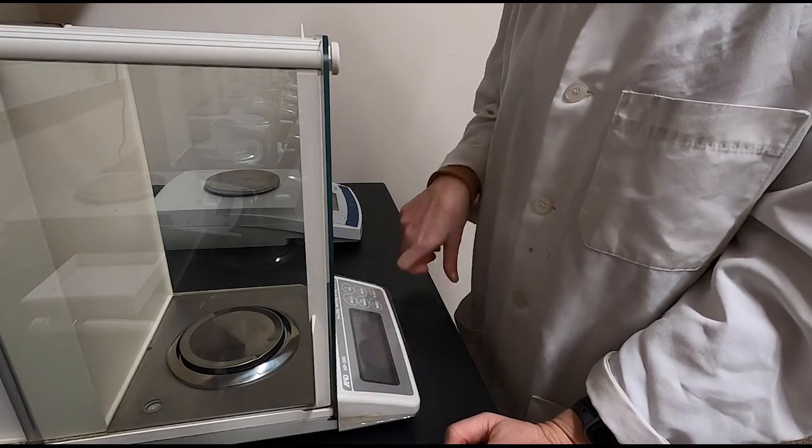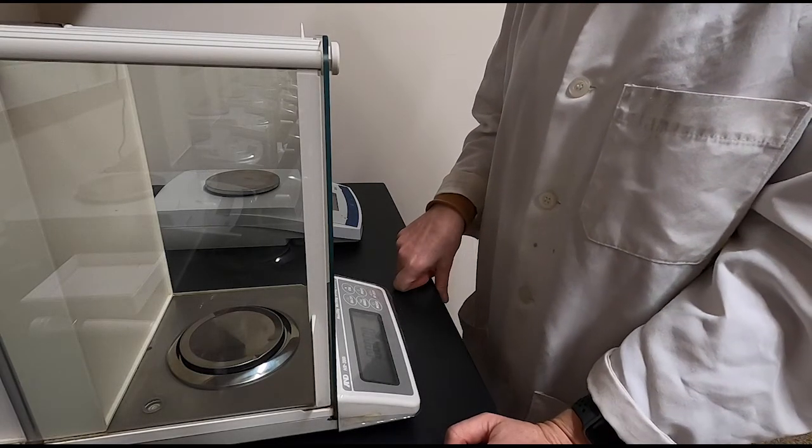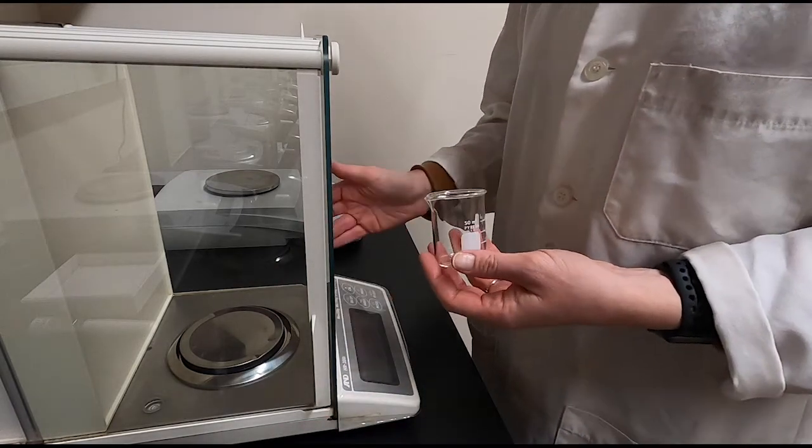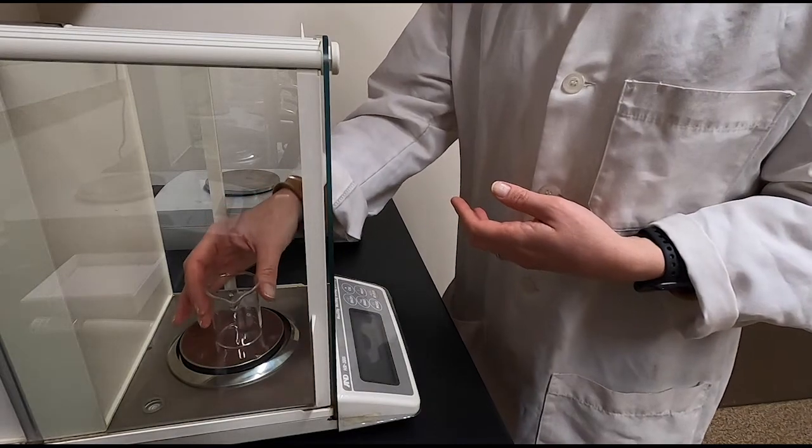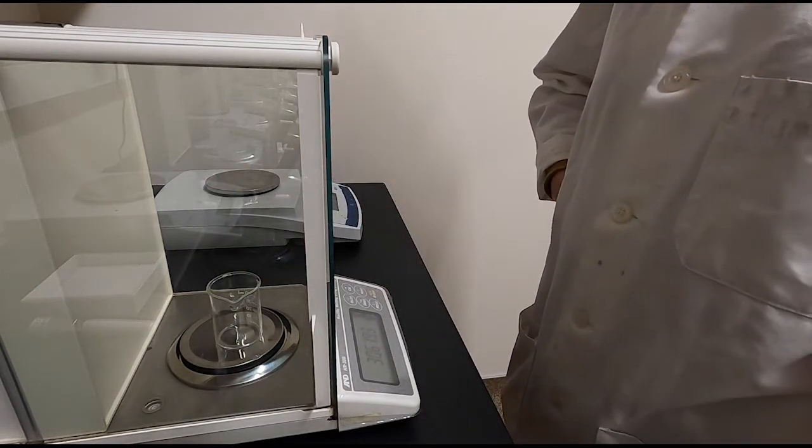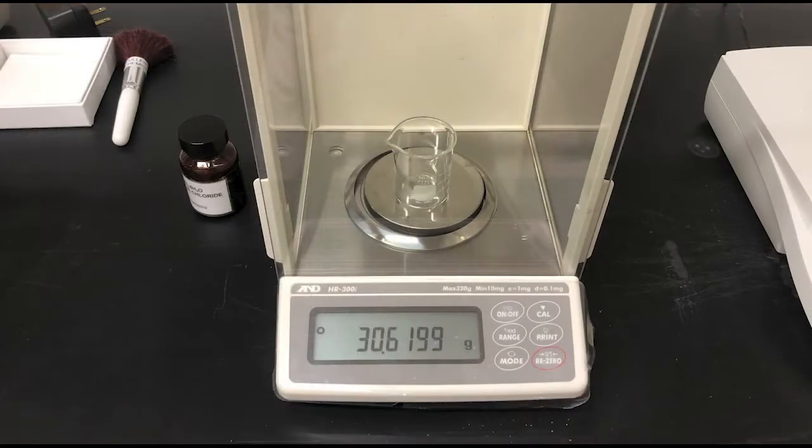We're going to weigh this out using the analytical balance. First I'm going to tare the balance so that it's zeroed out. Then I'm going to place a small beaker on the balance. Go ahead and write down the mass of the empty beaker in your lab notebook.